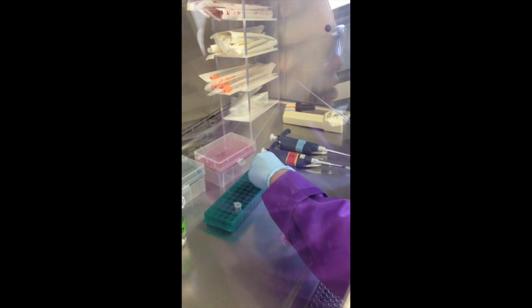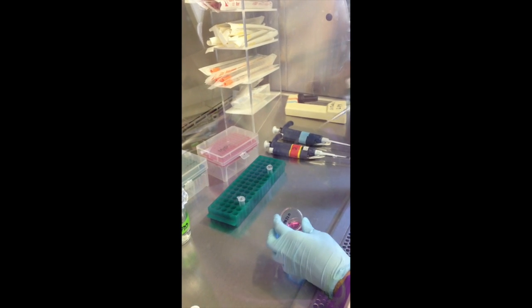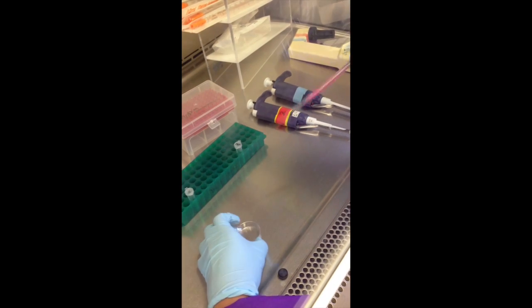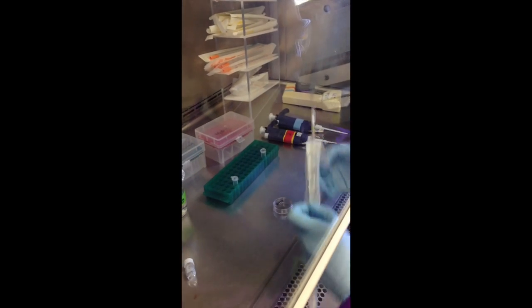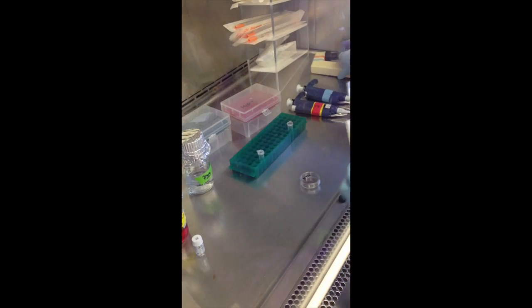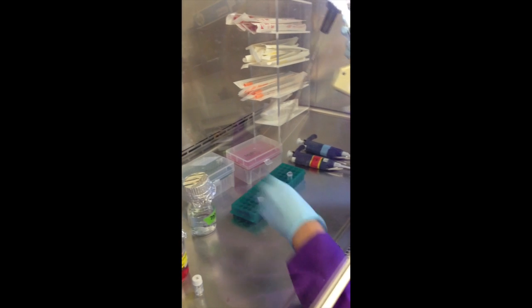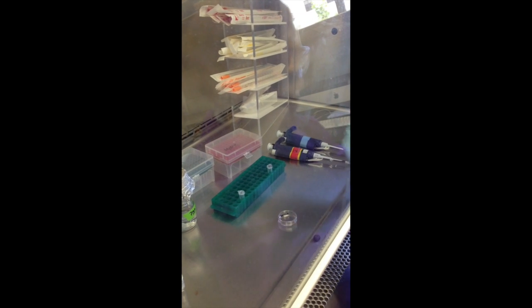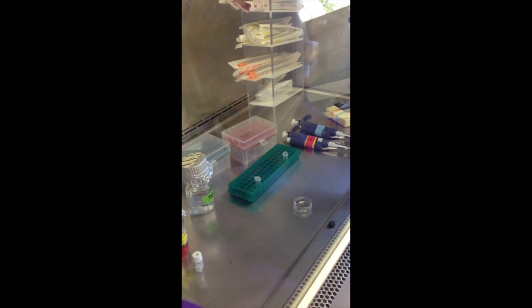While the DNA mixture is incubating, you're supposed to remove the media from the cells. Then rinse the cells with PBS, and then remove the PBS.